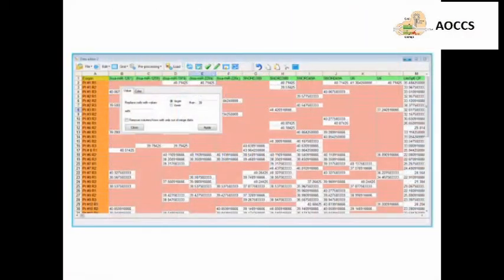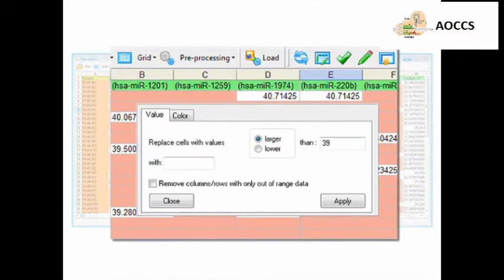Next, define a cutoff value that will discard data higher than the Threshold Cycle, or CT. If a microRNA has a CT that is greater for one replica out of three, that reading will be replaced with the average of the CT from the two other probes.